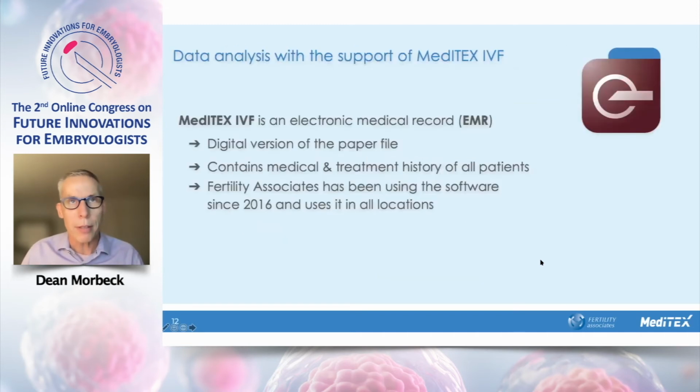So I'm going to, again, just share some of the ways that we approach this in a manual method. So MedITEX is an electronic medical record. As I said, it's a digital version of the paper file. Hopefully many of you are now using EMRs. And we've been using it, as I said, since 2016, and we use it in all our locations. We also use it in Malaysia, in our main clinic in Bangsar South, in all the laboratories, also in the other 3 sites that we've got currently active with IVF labs.